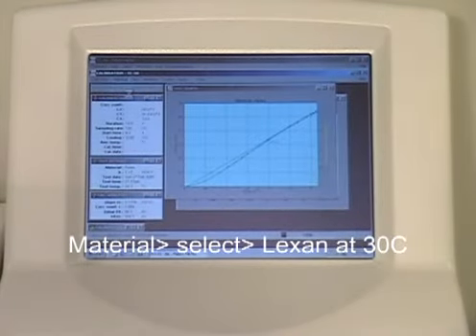After completing two tests on your second reference material, proceed by selecting your last reference material from the Material button on the top menu bar.